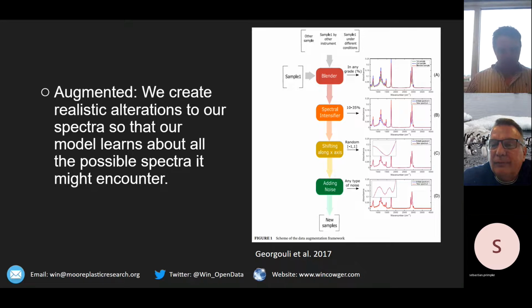I think this is the advantage that we say, okay, we use the best method for getting particle sizes and then put the sample into the pyrolysis cup and do pyrolysis and get the mass as well, because then we don't need to do this mass estimation stuff and get really reliable results. I think also, and that's why we use silver filters, because we can fold them and put them into pyrolysis.